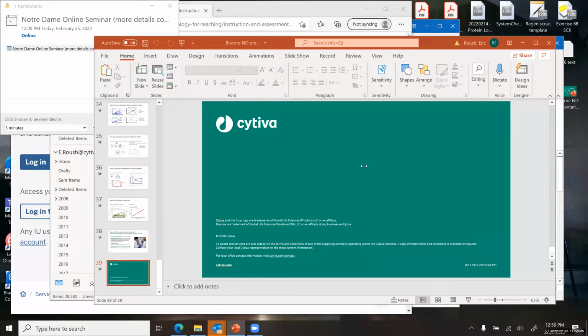Yes, CM5 chips can definitely be used. Our instruments can tolerate up to 10% DMSO. Other common co-solvents may be at lower concentrations. We do have a chemical compatibility guide in the manual for our instruments. L1 is probably less optimal for organic solvents because you're typically using the L1 chip to capture membranes. And those membranes are going to commonly not be stable in the presence of those organic solvents.